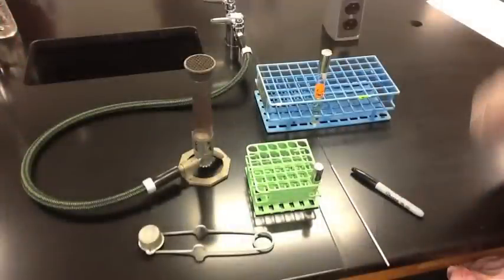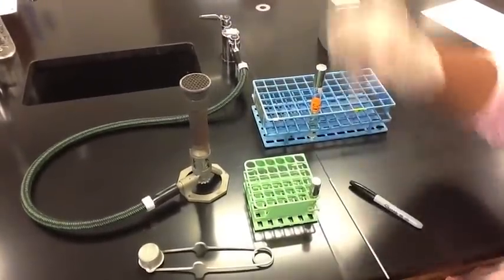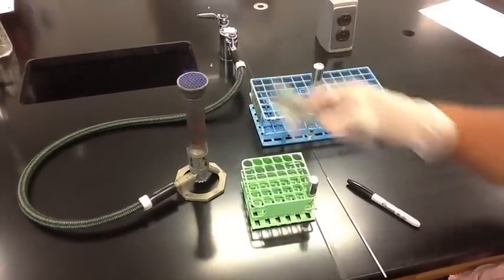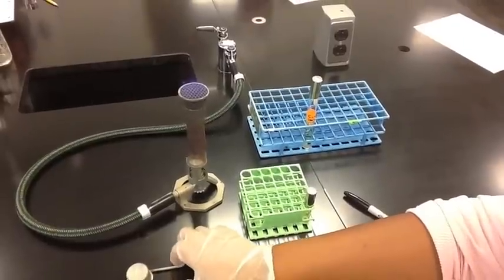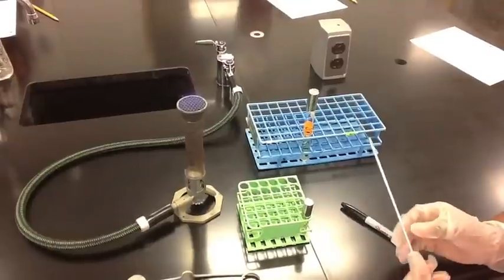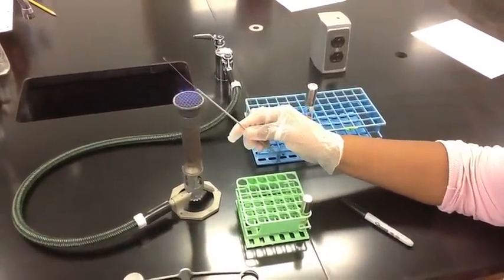As you are about to begin your aseptic transfer, you should make sure that you have labeled your sterile broth tube. Then you should proceed to light your Bunsen burner as shown in the video. Once lit, you will use the Bunsen burner to flame and sterilize your inoculating loop.